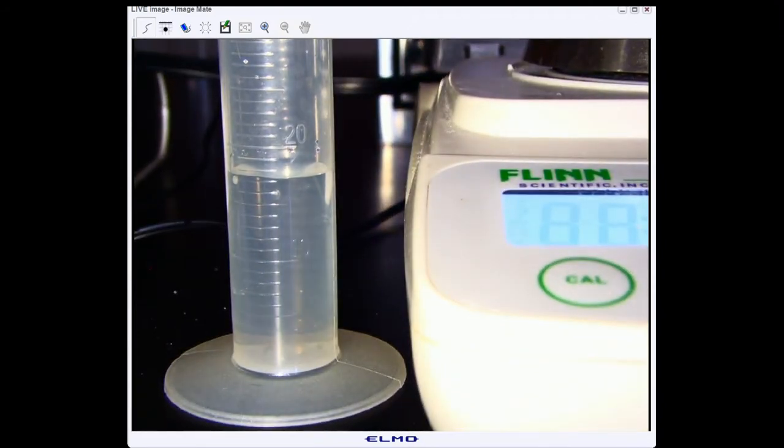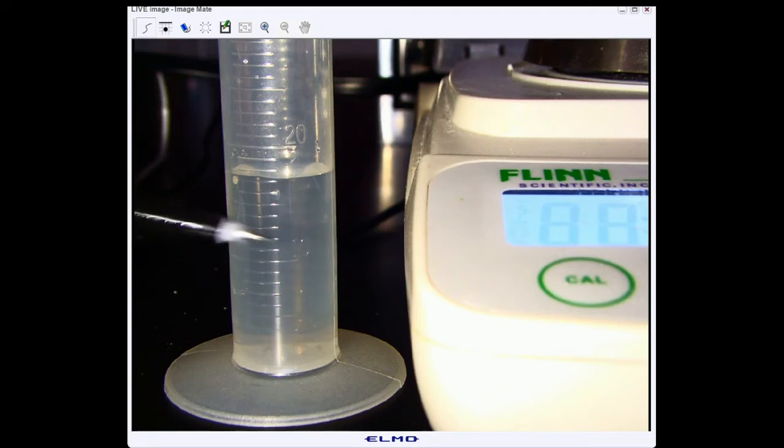Now we went a little over here. Each graduation on this cylinder is worth one milliliter because our major graduations are 10 and 20 and there's 10 lines in between. So here we've used approximately just over 17 milliliters of vinegar, which is okay, we're in the right ballpark for this lab.